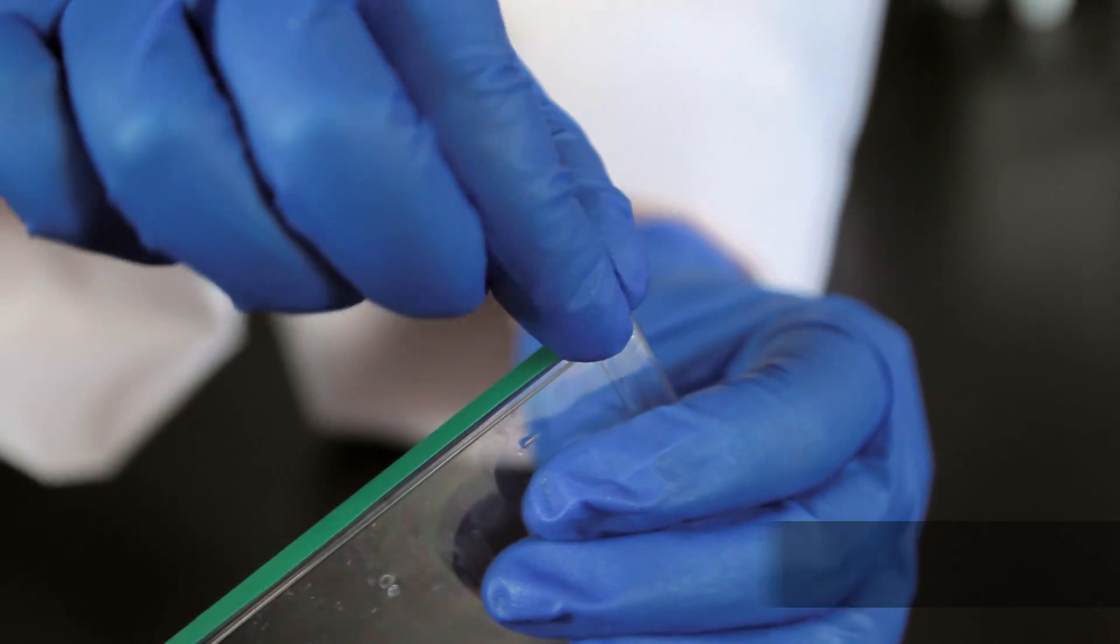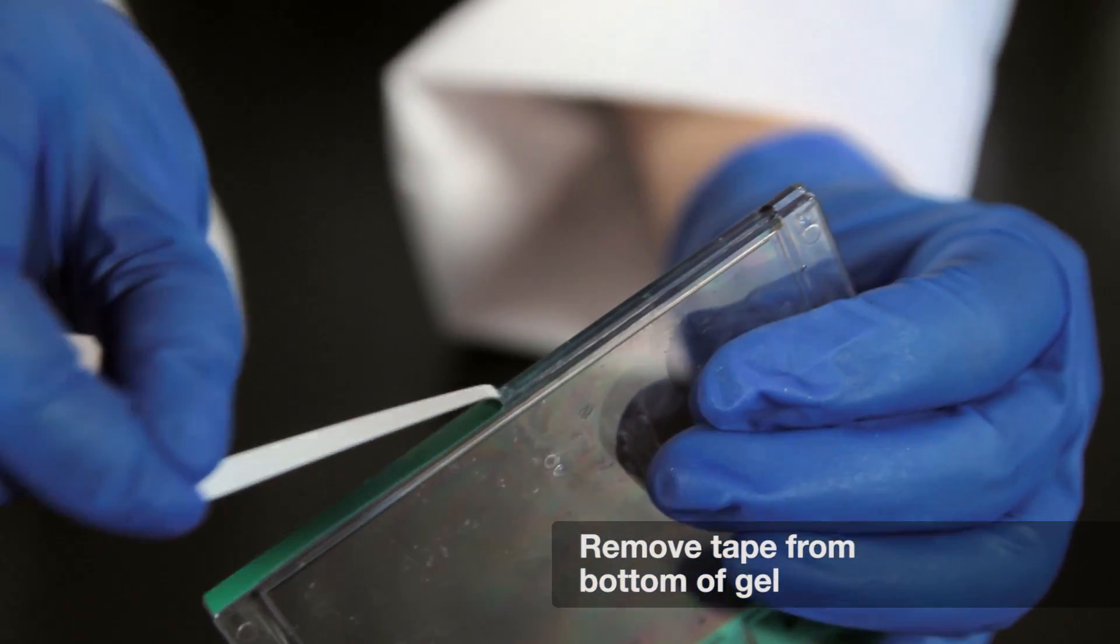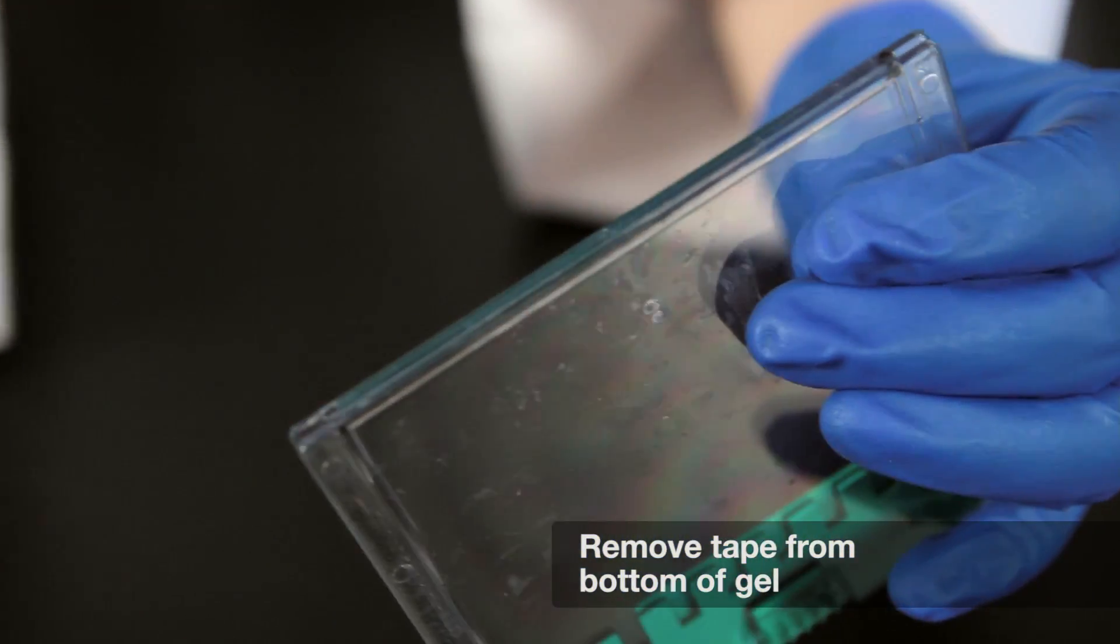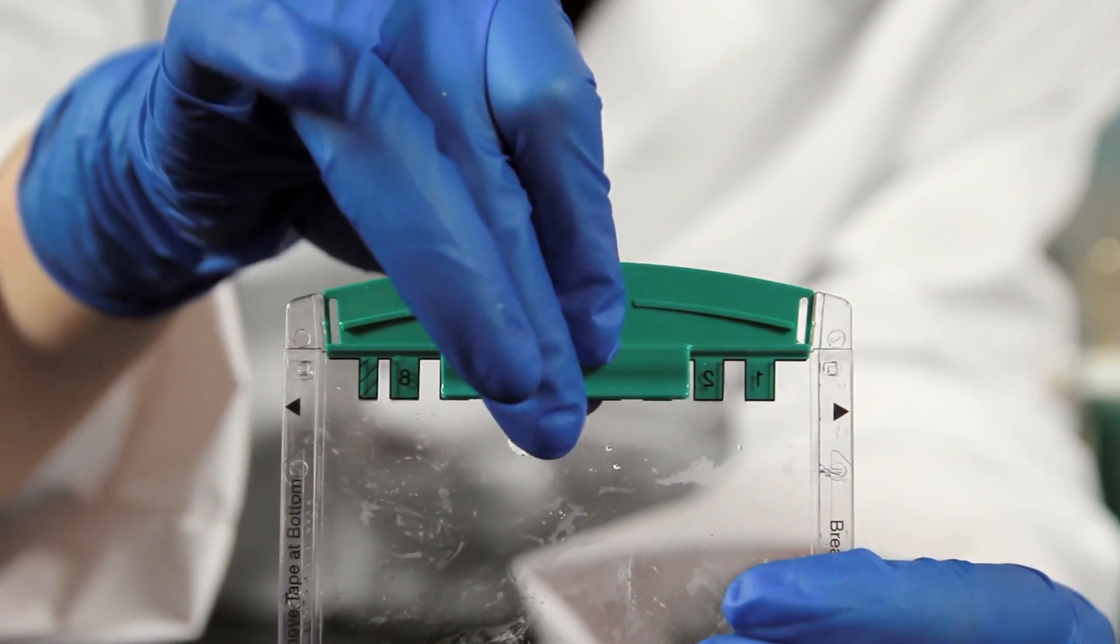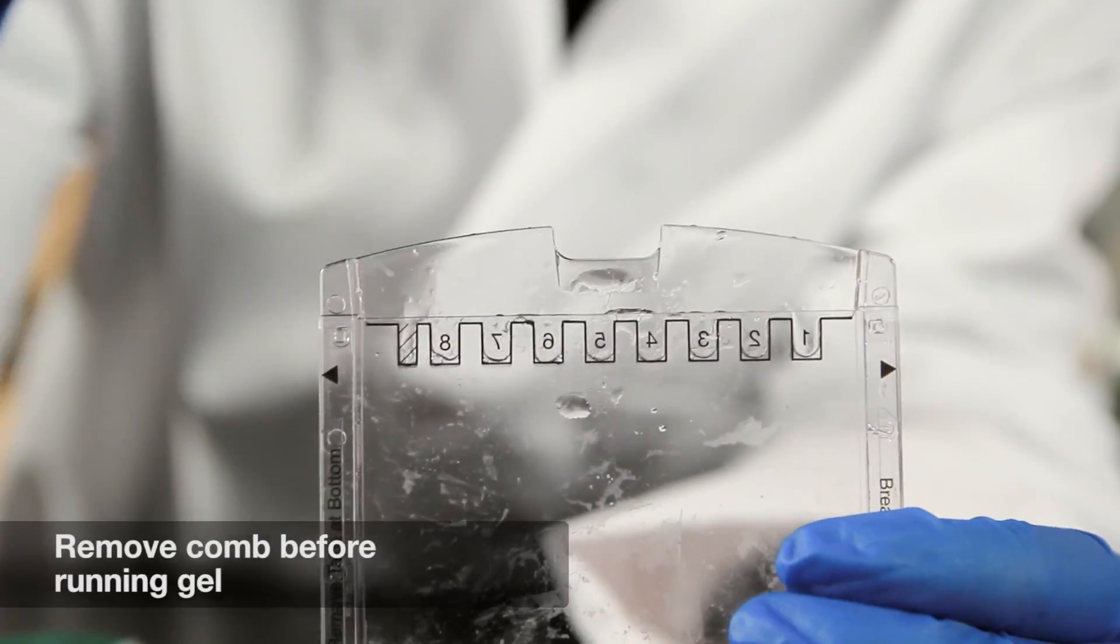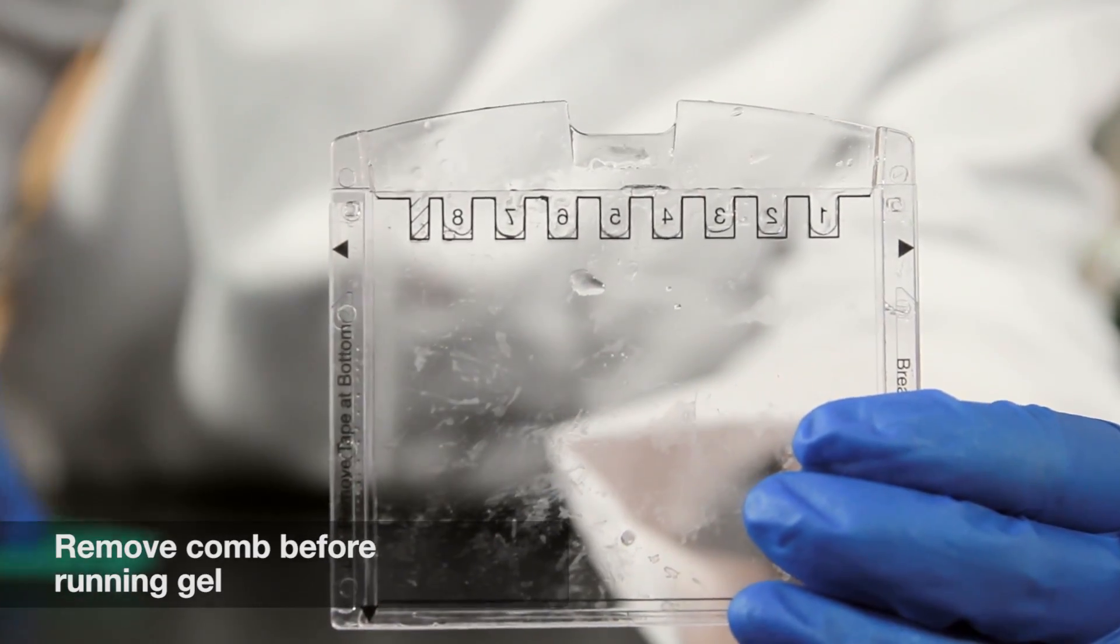First, if using ready gels, make sure the tape has been removed from the bottom of the gel. Also, it may be difficult to see the comb once you've assembled the gel sandwich. You should always remove the comb before you run the gel.